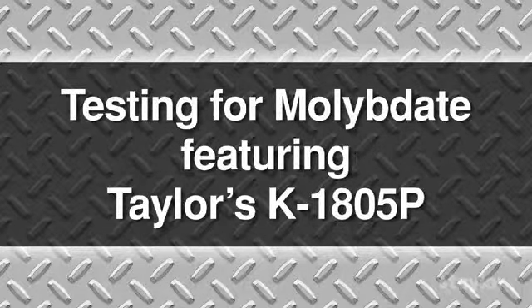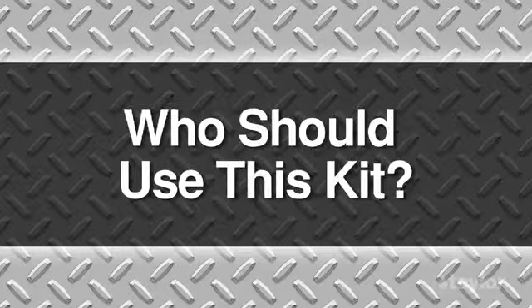Testing for molybdate, featuring Taylor's K-1805P. Who should use this kit?